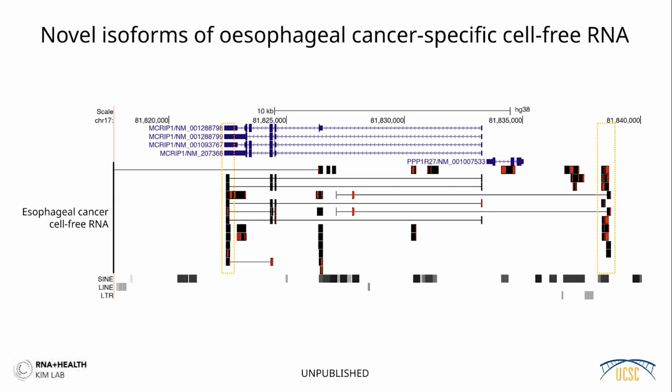So here, again, on the top is the annotated RNA from this particular gene. And then here, these are these novel annotations, including these 5' upstream transcription start site RNAs that are, again, found within these hotspots of transposable element transcription as well.